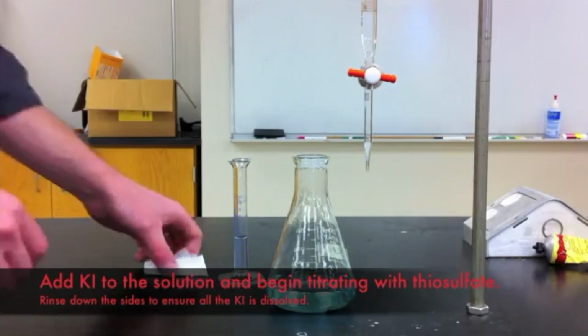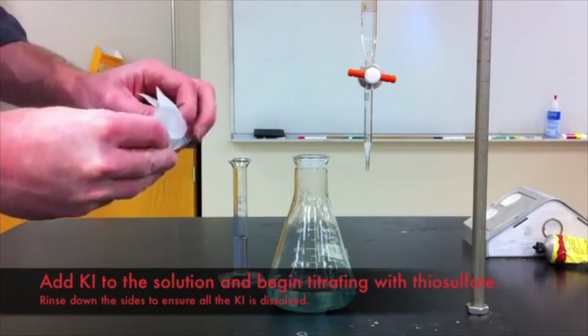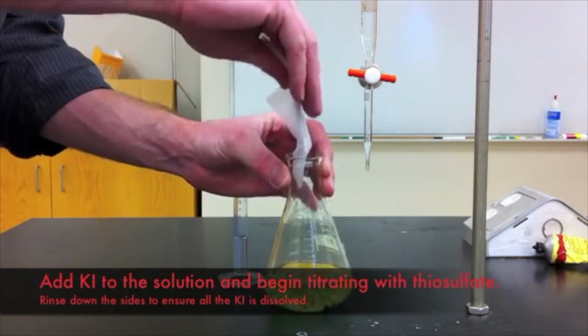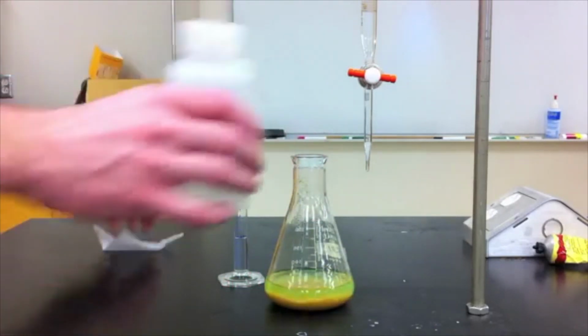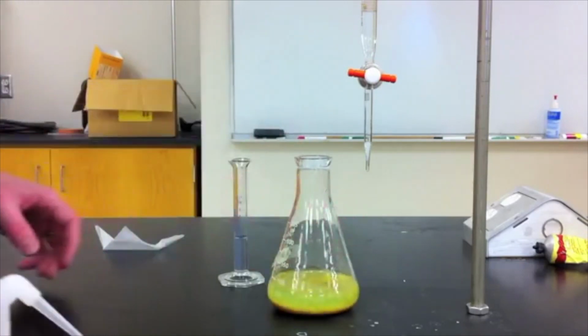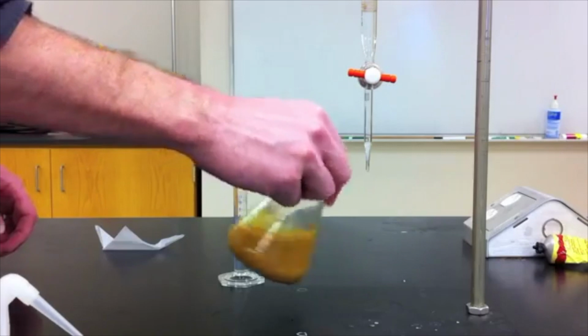So in the flask we have a solution of Cu2+ ions, so we have a blue solution, and if potassium iodide is added to the flask and we swirl the flask, and we're going to add some water here to ensure that there's no potassium iodide on the walls of the flask, you can see that a cloudy brown solution forms.